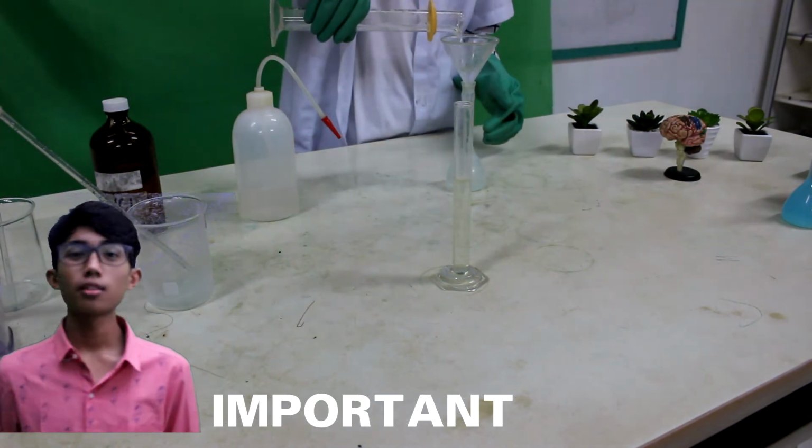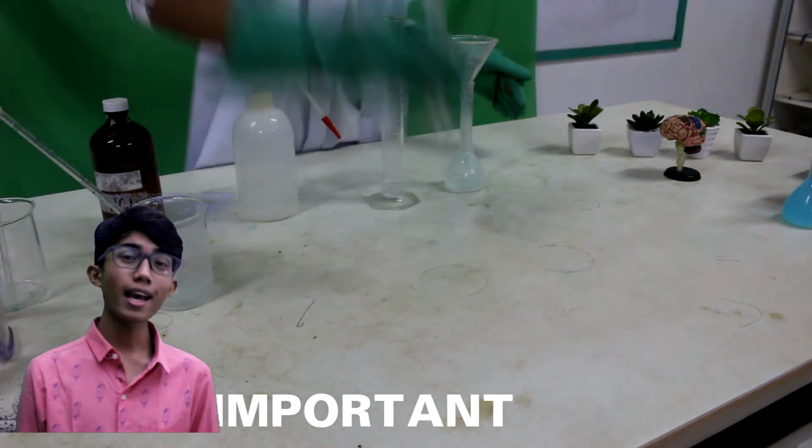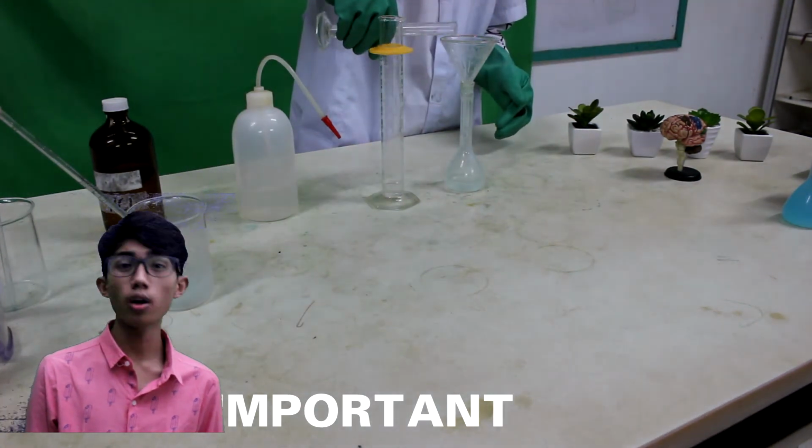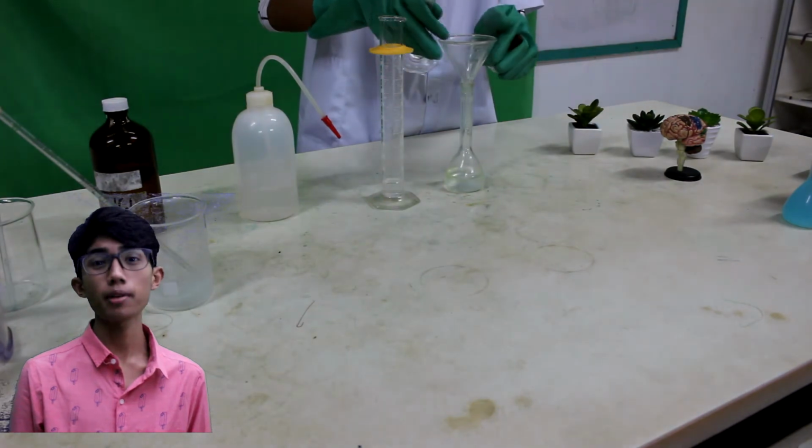Take note, water always comes first before the acid because adding the acid first before the water may cause your solution to spike up in temperatures in a short period of time.